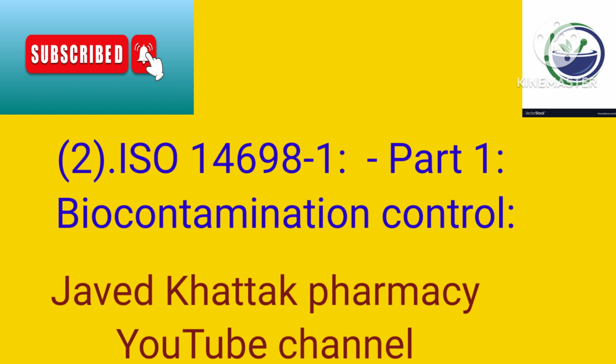It provides guidance on methods for evaluating and controlling the levels of viable microorganisms in the air and on surfaces. Biocontamination control is crucial in sterile areas to prevent microbial contamination of pharmaceutical products.